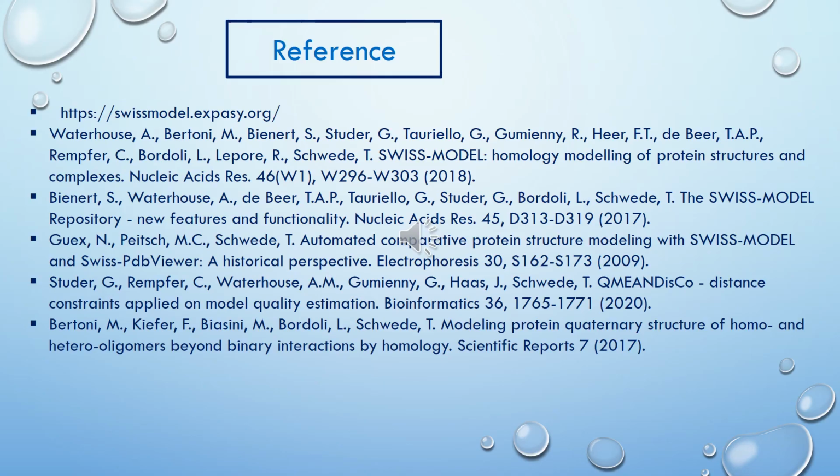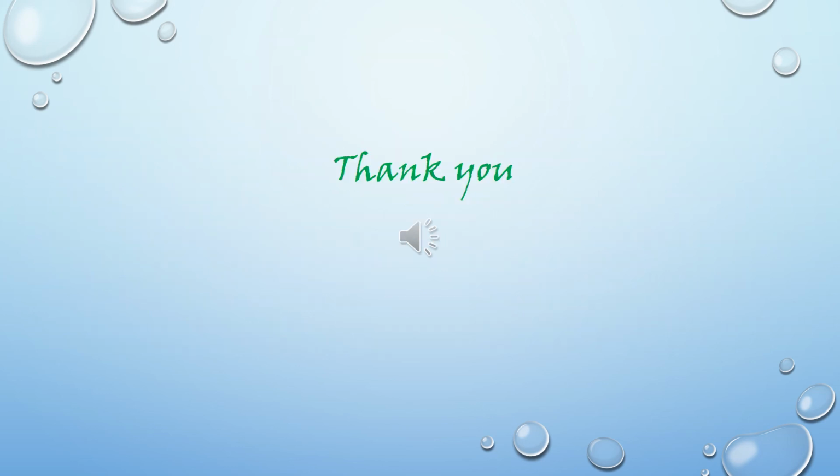If you want to know more about the Swiss model web server, you can go through the links and the research paper links given here. Practice it.